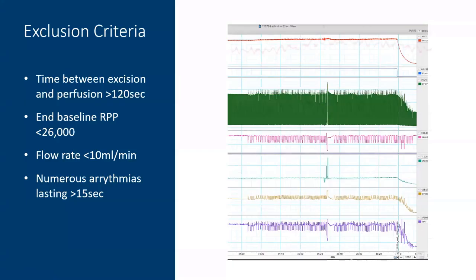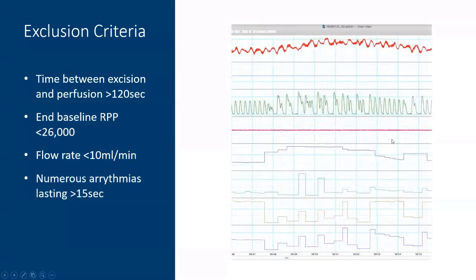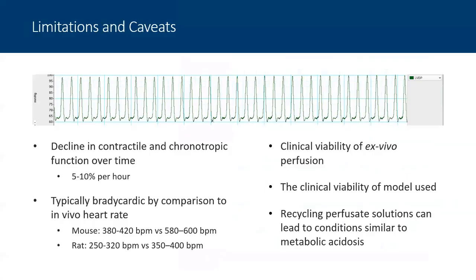If we are to zoom into this region, you'll see that we actually get a lot more detail, and we can see that these are alternans. So there's a change in the calcium handling within the left ventricle that's creating these arrhythmias.